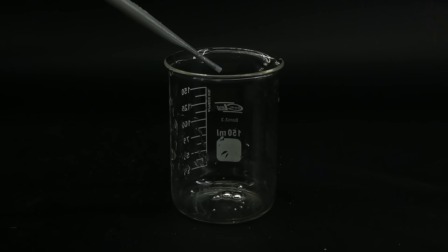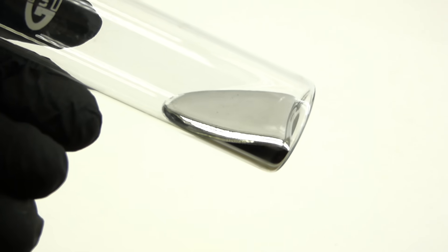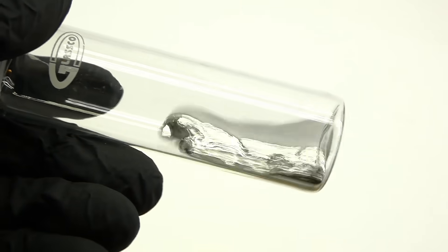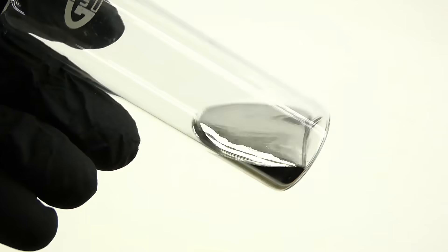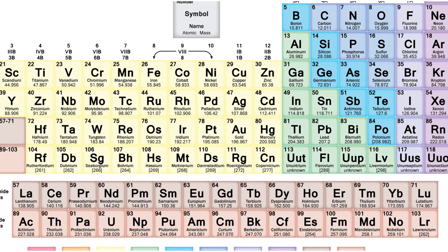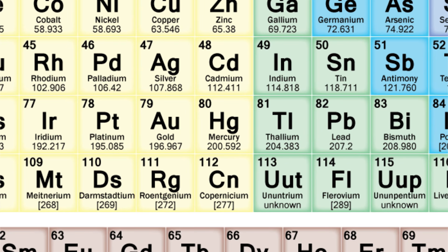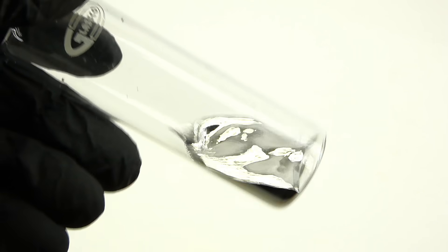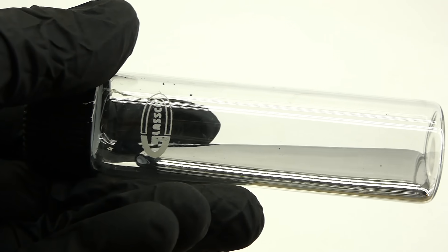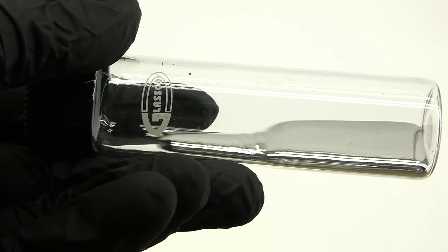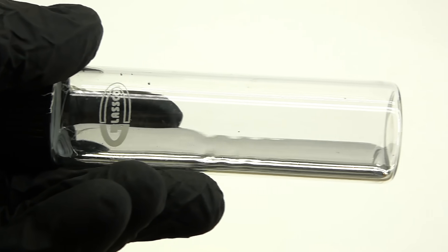So in today's video, I will be making some mercury, which is an extremely interesting element. Despite lying near the bottom of the periodic table and being a heavy and toxic metal, it has some very cool properties. One of them is that mercury is the only metal that's liquid at room temperature, and just this makes me really want to have some.